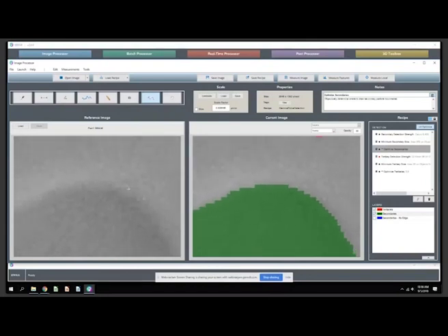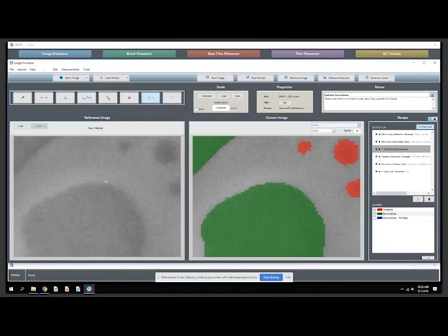Well, where you stop affects what you measure. If you bump them out a pixel, you're going to measure a higher volume fraction. It wouldn't be fair to always play with your image analysis parameters to give you the volume fraction you hope you measure. We'd like to be a little more objective in how we decide where to draw these boundaries. So what we've come up with is an engine called optimization that can be applied to, I think, roughly 10 different steps in a recipe. The ones that are optimizable are listed in our user manual. And how it works is, what this step really does is it tries to shrink the particles.